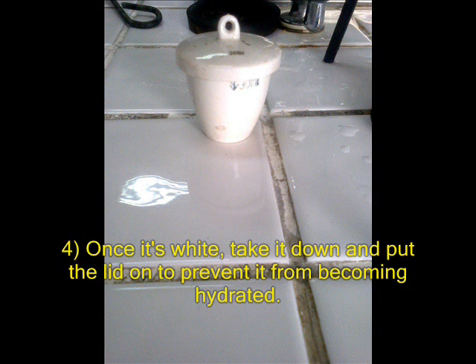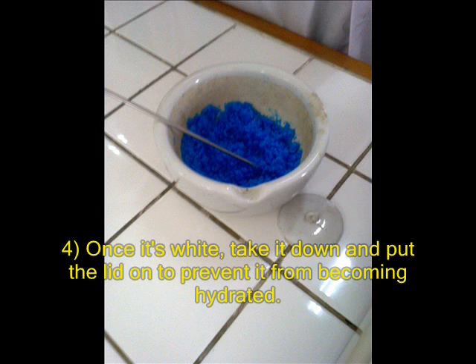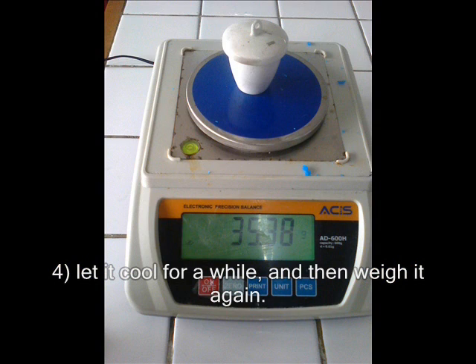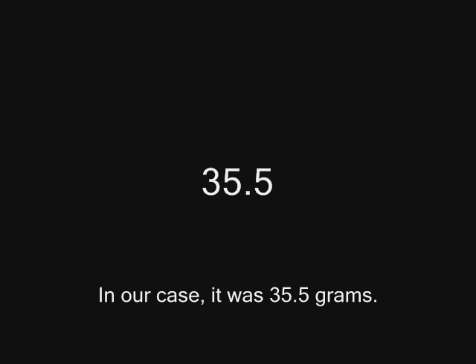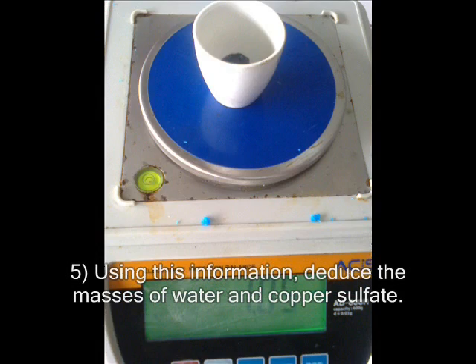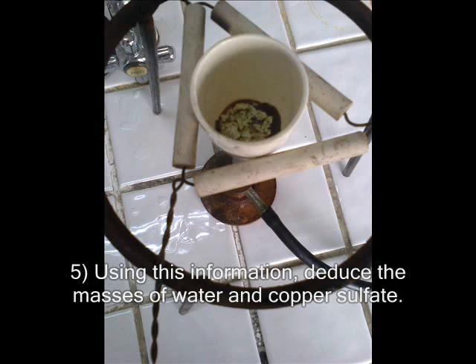Once it's white, take it down and put the lid on to prevent it from becoming hydrated again. Let it cool for a while, and then weigh it again. In our case, we got 35.5 grams. Using this information, deduce the masses of water and copper sulfate.